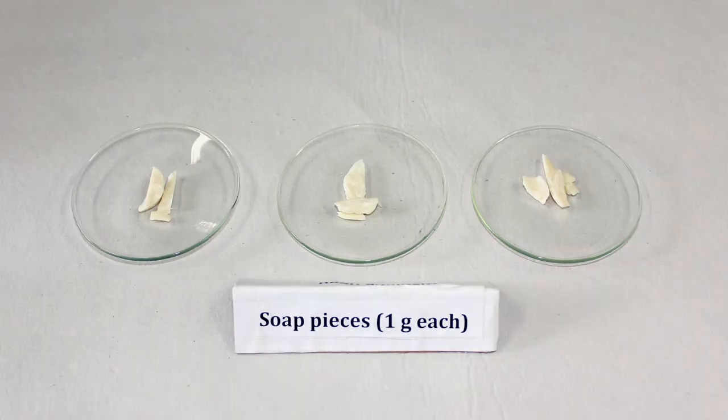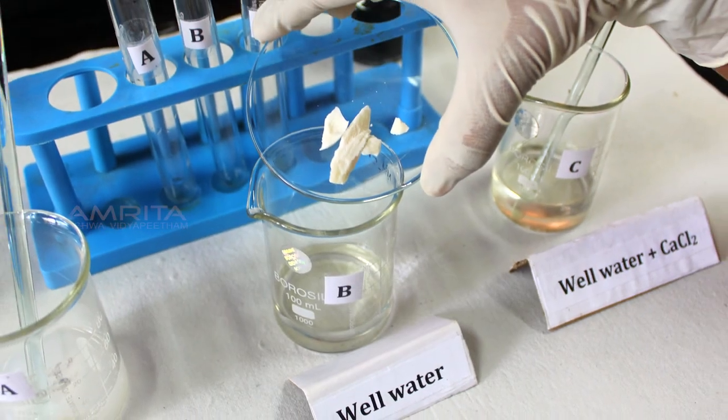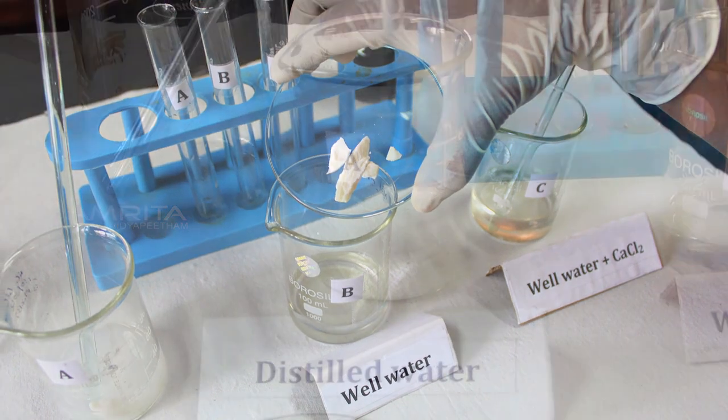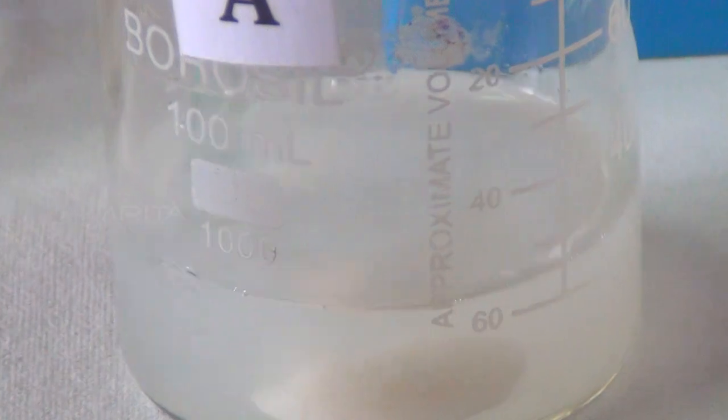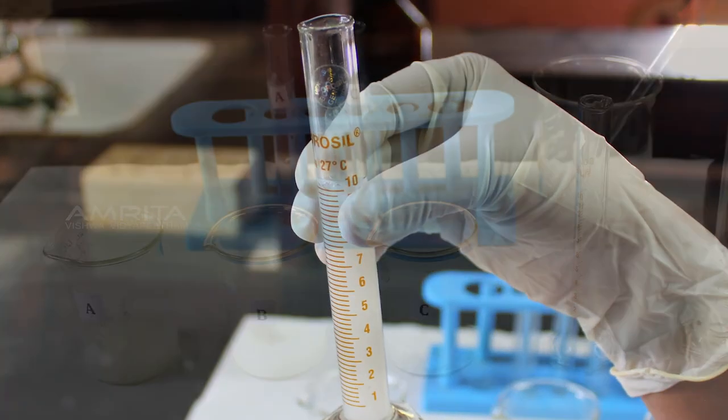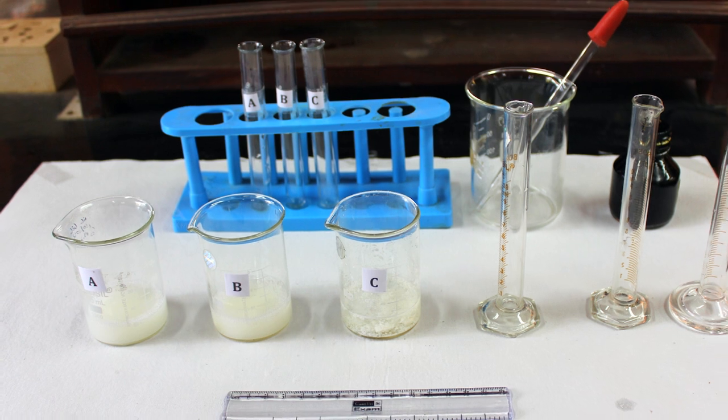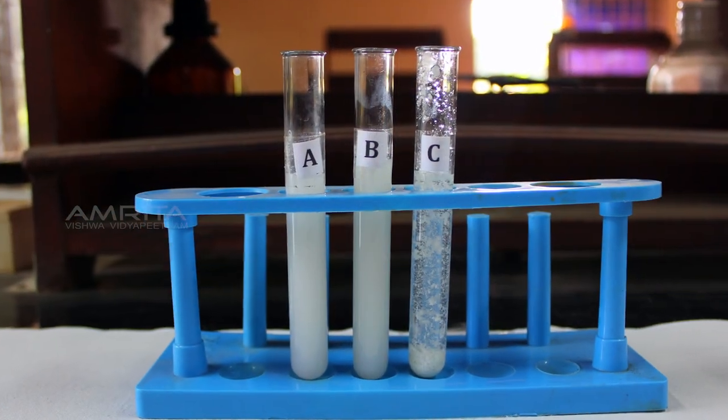Precautions: Use the same sample and the same weight of soap from beakers A, B and C. While stirring the soap solution, do not spill any solution from the beaker. Carefully measure the same quantity of soap solution from beakers A, B and C to put it into the experimental test tubes A, B and C.